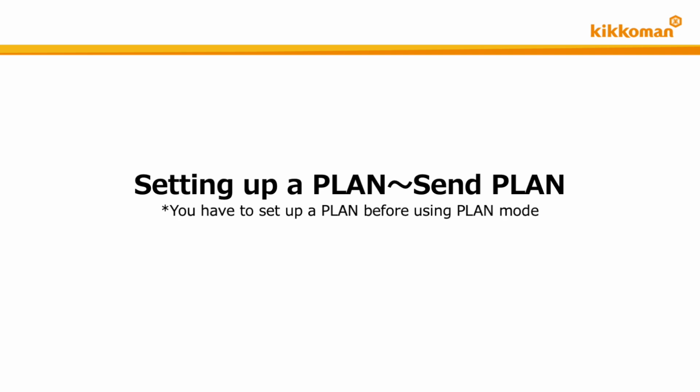When using the plan mode, you need to set the test points and plans in advance, then send the plans you want to use into the Lumitester Smart. For how to set test points, please see our video, How to Test in Standard Mode.